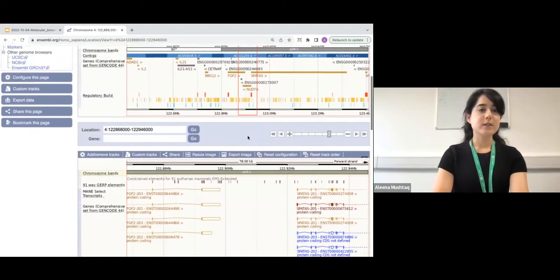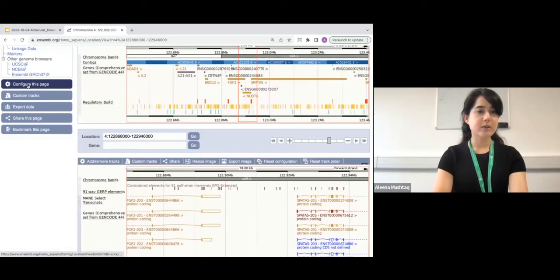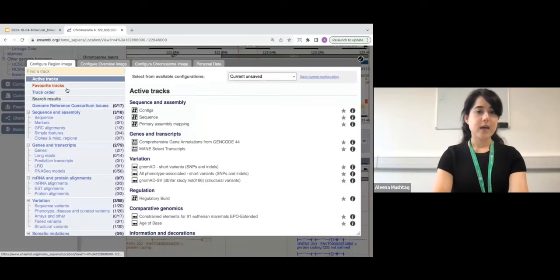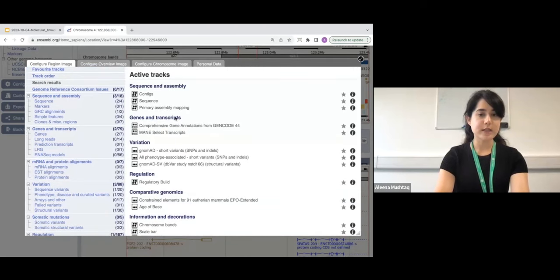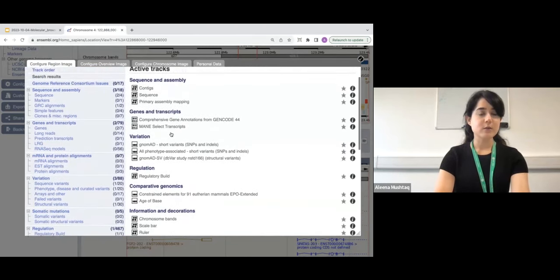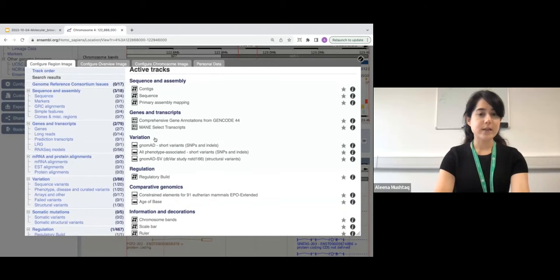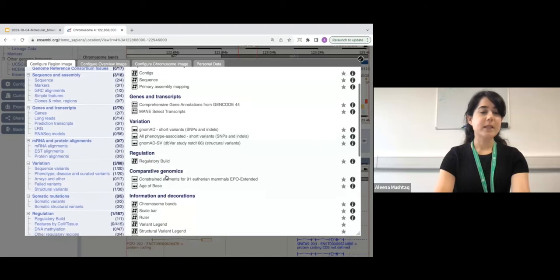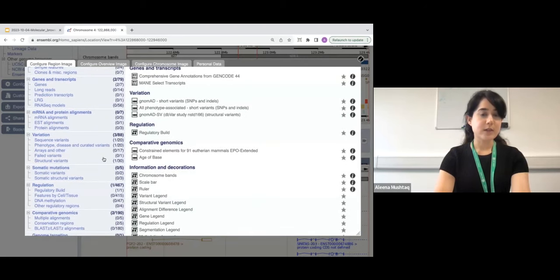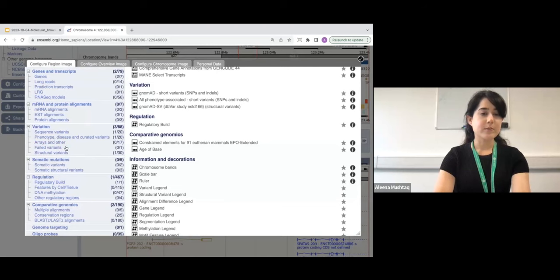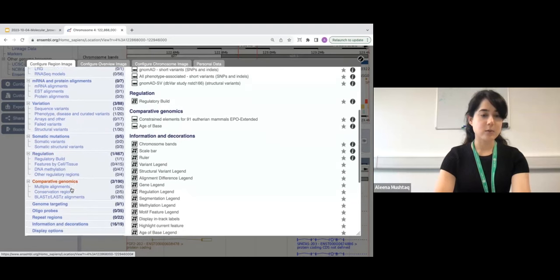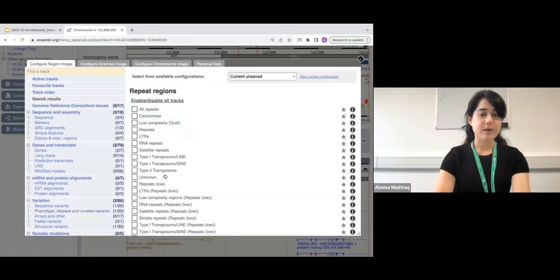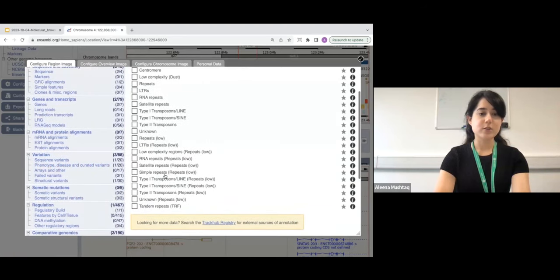From 'Configure This Page', you can see all the data tracks already turned on by default — genes and transcripts, variations, regulation data, and comparative genomics data. You can also select further specific data to display on the images: variation data such as structural variants, regulation data, some comparative genomics, repeat regions, and so on.